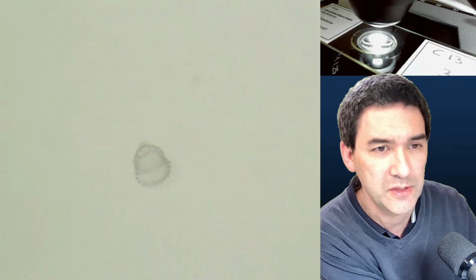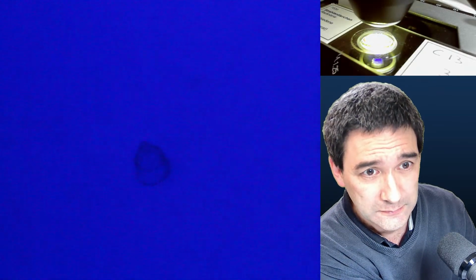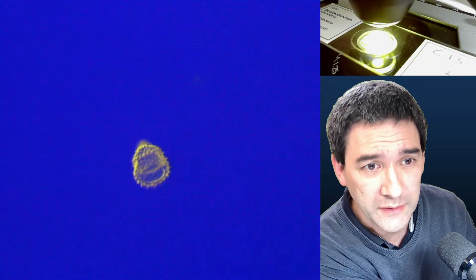Okay. So I'm going to remove now the filter holder. Let's turn it down a little bit so that it's not bright field. I'm going to put the filter directly over the lamp. Yes, it does work. So that's basically, I'm now holding it over the lamp somehow.